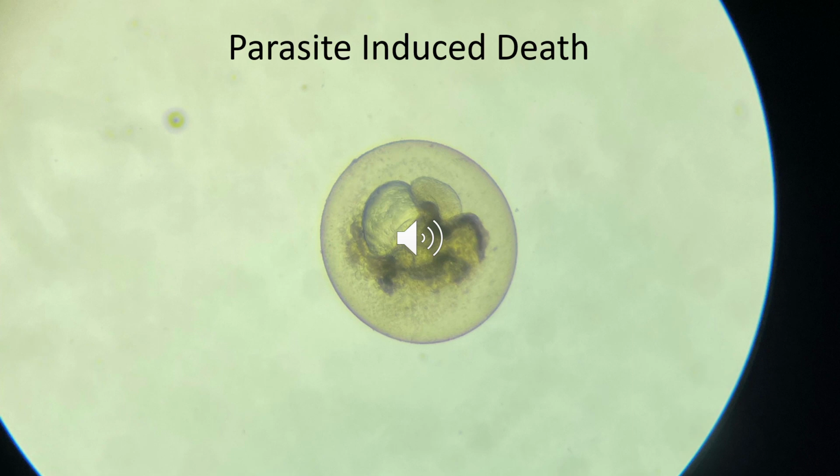On a final note, I would just like to take a moment of silence for the ones that did not make it. In one of the developmental trials for the zebrafish, there was a parasite present that did, in fact, kill quite a few of the developing zebrafish.